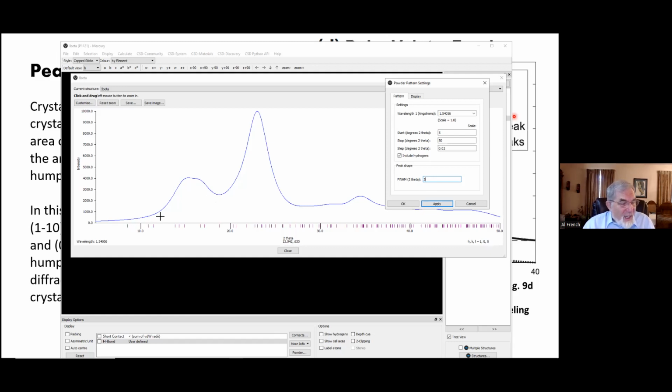So when you do the Segal calculation, this should give you 100% crystallinity in principle, because there is no information on amorphous in this sample. But the Segal would say 75% crystalline, and that's really more of a reflection on the crystallite size. Now, it's true that if there is an amorphous contribution here, that's going to raise this up even higher. And so you could come up with some sort of method where you found the difference between what you'd expect by calculation and what the value actually was on your experimental pattern, and say, well, that much of it was amorphous and the rest of it was a size fraction.